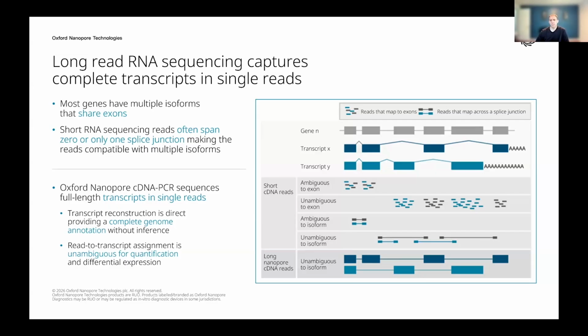And long read RNA sequencing, therefore, can address many of the same expression and differential expression questions that you'd have with short read sequencing, but it's also going to provide much higher resolution into the transcript structure, information about splicing and fusion events.